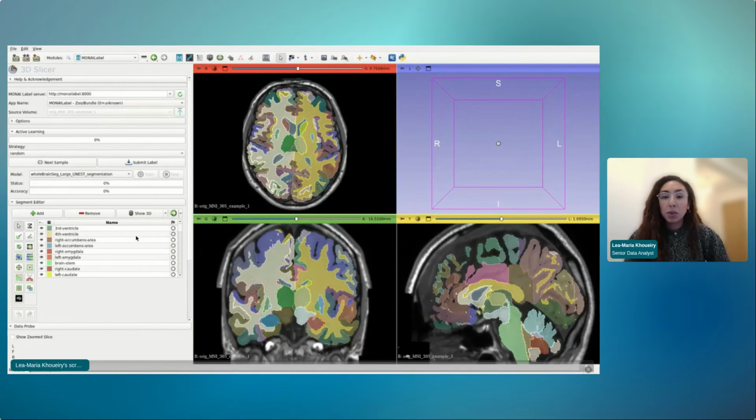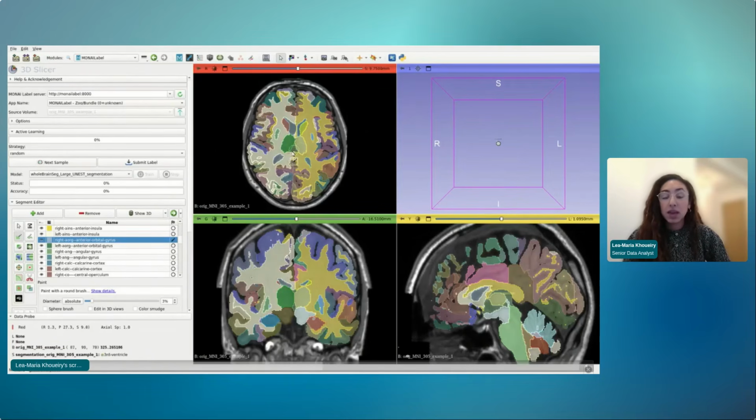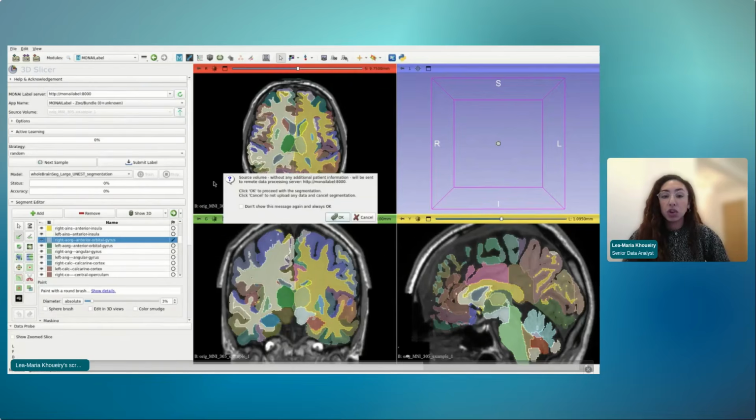So this is after I run my model. It looks like a really nice segmentation. This means that the model has worked really well. In the case where this is not completely accurate and you want to change it, you can definitely manually annotate the images yourself, change some colors, etc., where you have different tools that allow you to change these.